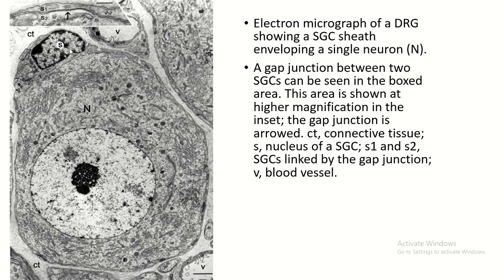This is the satellite cell and nucleus of the satellite cell. This is the nucleus of the cell body of the sensory neuron. You see the distribution of the rough endoplasmic reticulum evenly. The Nissl substance is formed by the rough endoplasmic reticulum, ribosomes, and free ribosomes.